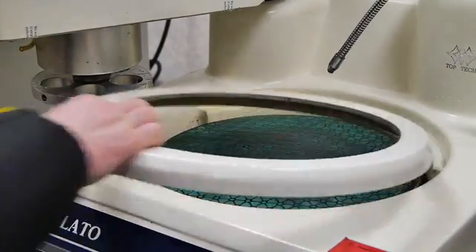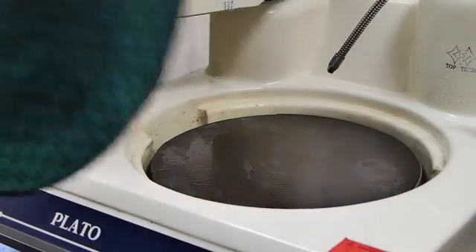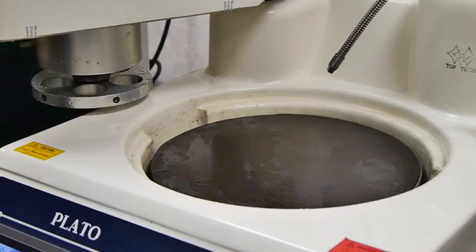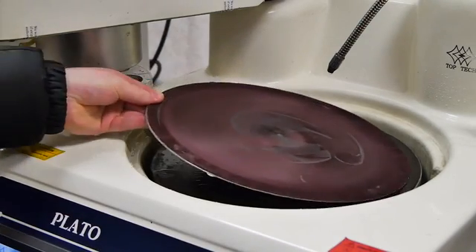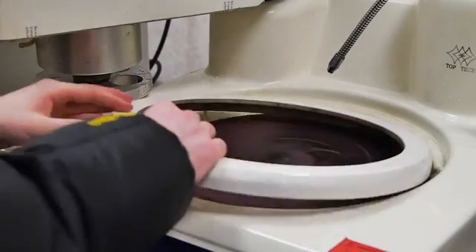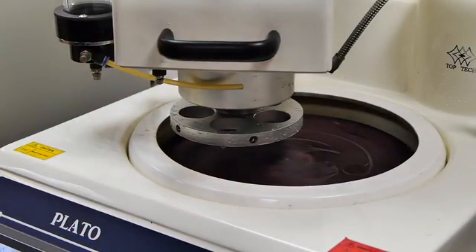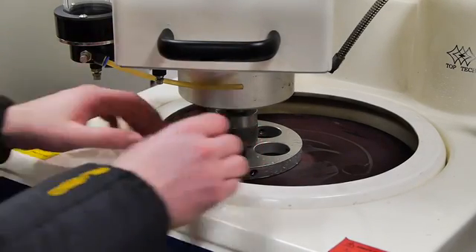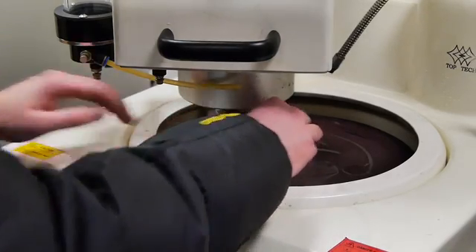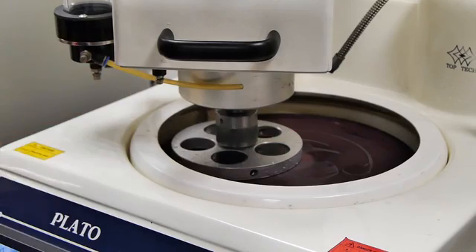The next stage we will be using a napple cloth with Diamax Poly 3 micron suspension. This route took 12 minutes, however if stop removal is required time will increase accordingly.